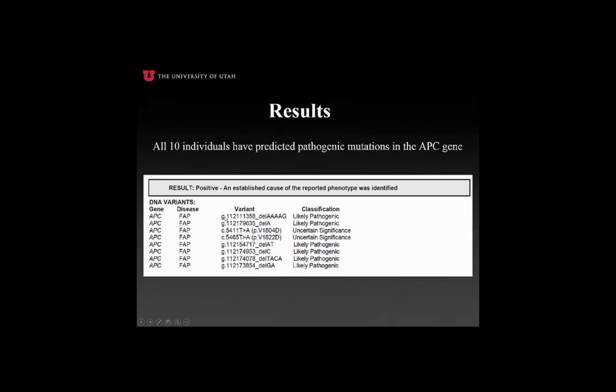Note here that instead of mRNA coordinates for these deletion variants, I only list the genomic coordinates, because VAST outputs only the genomic coordinates. It doesn't output the coordinates of the mutation in the mRNA sequence, and I had a hard time reliably lining those up with specific changes in the mRNA sequence, so I've only listed the genomic coordinates.